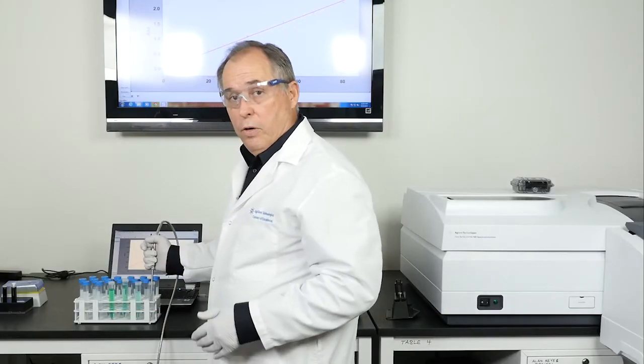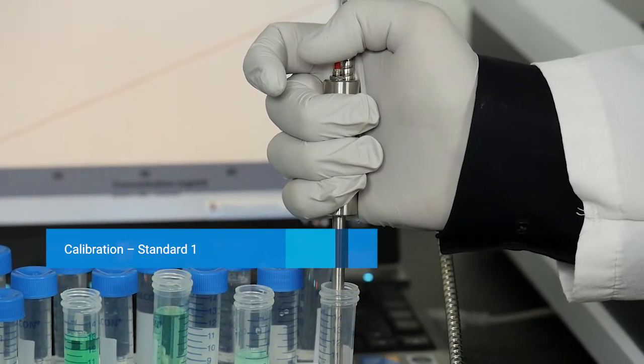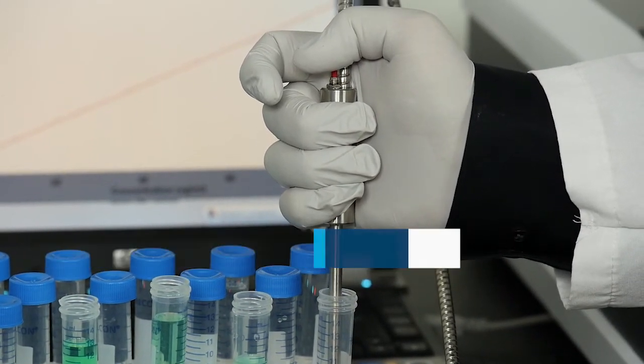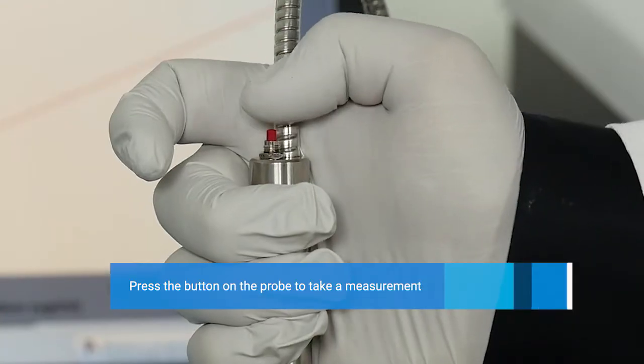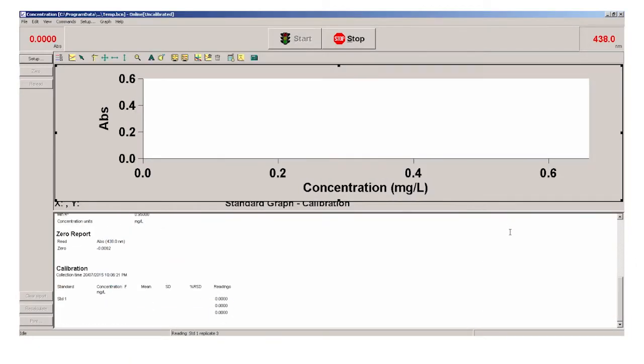So now we're going to construct a calibration curve to show how easy it is. I place the probe inside the vessel. I have to make sure that I cover the full path length, which I do. Now all you have to do is just click the trigger and the measurement is made.